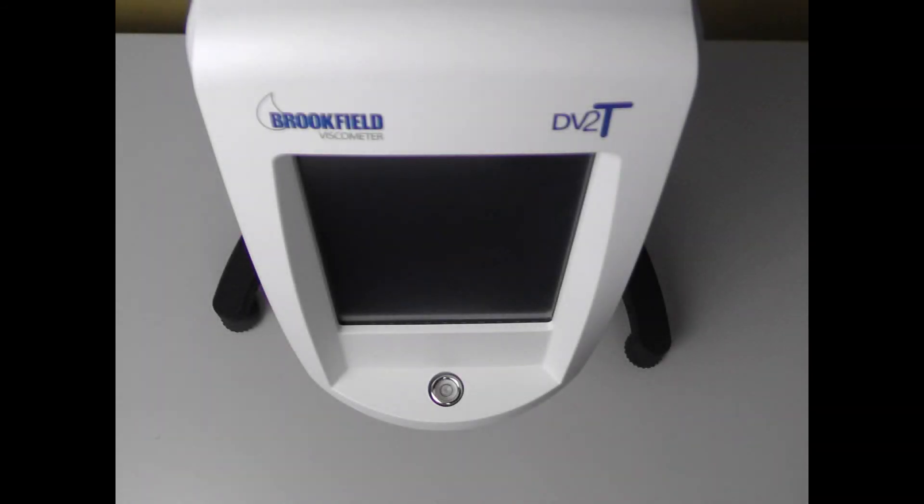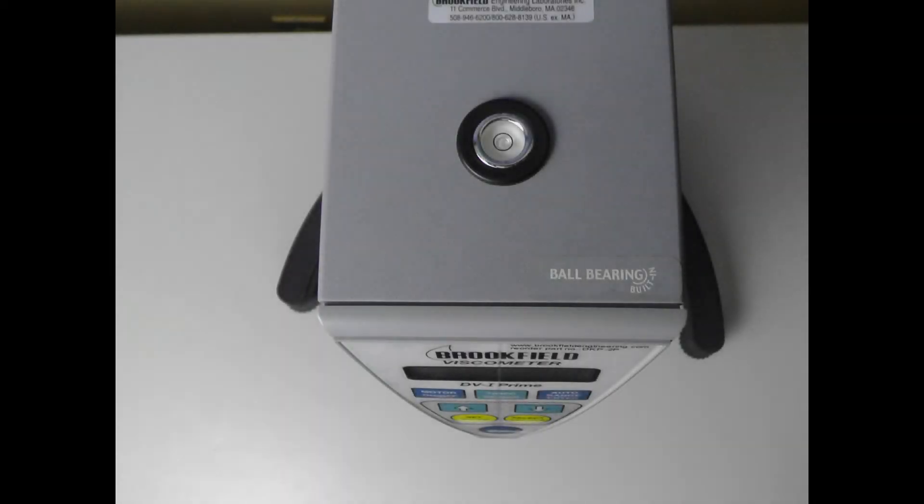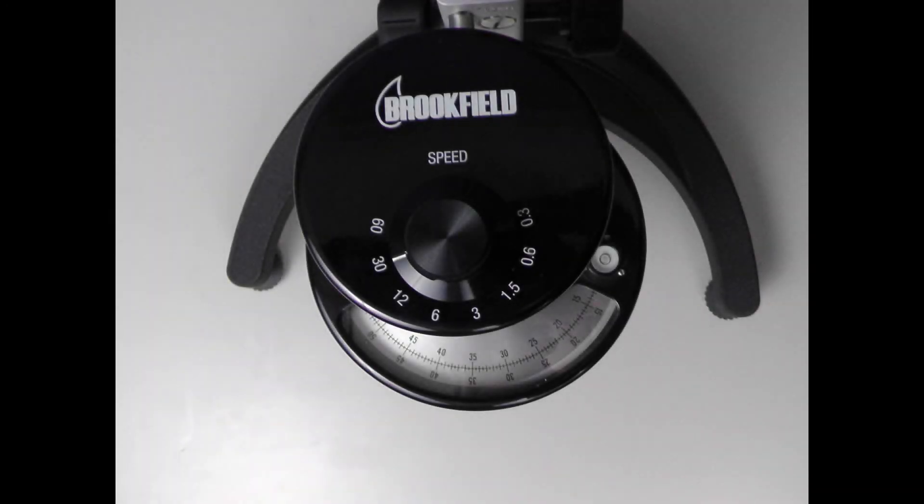On our DV2T and DV3T units, the bubble level is located on the bottom center of the viscometer below the touch screen. On our other digital viscometers, the bubble level is located on top of the instrument head. On our analog units, it is located next to the dial housing.